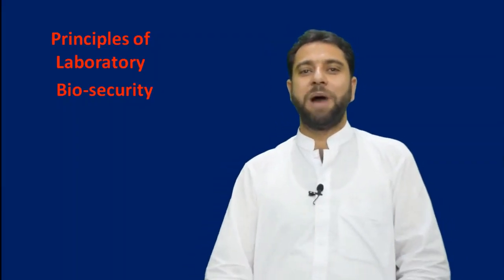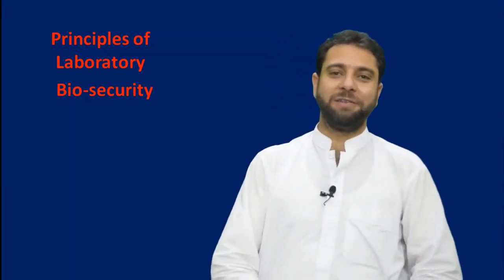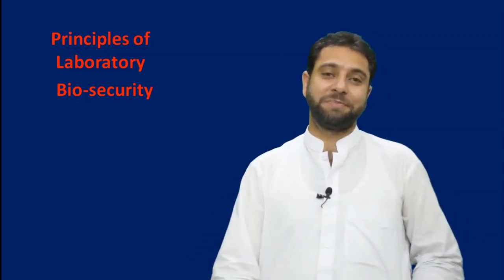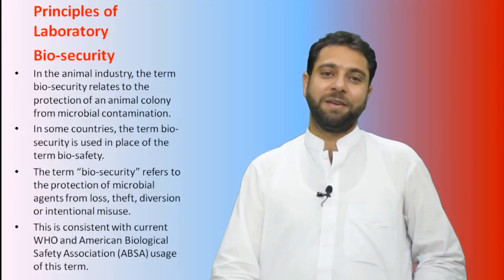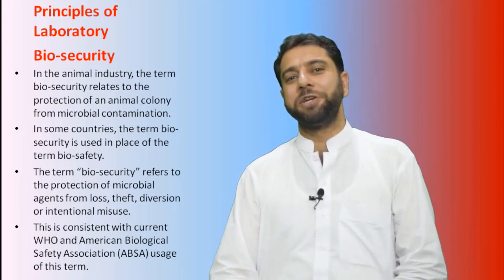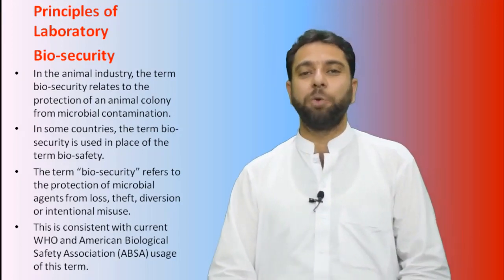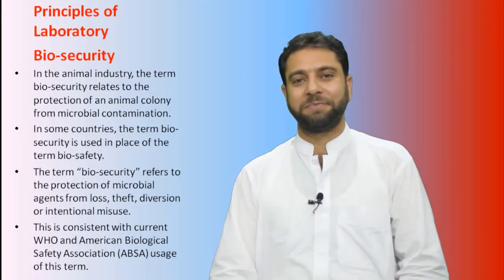Principles of laboratory biosecurity. The term biosecurity has multiple definitions. In the animal industry, the term biosecurity relates to the protection of an animal colony from microbial contamination.